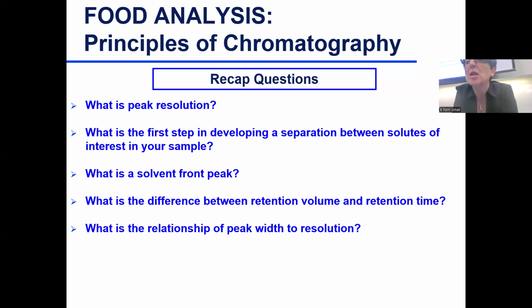So retention time is associated with retention volume. Instead of measuring the volume, you measure the time it took from the second of injection to the compound reaching the detector. When it reaches the detector, the time is recorded, and that's your retention time.